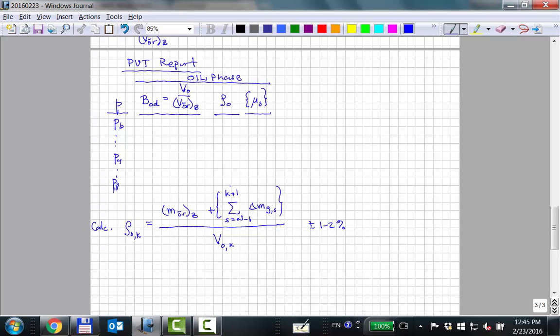Could it be like that? Huh? It was correct the way it was? Okay. But it can't be correct the way it was, because if you want stage N, you shouldn't add any gas. If we want stage N, we don't want to add any gas back.